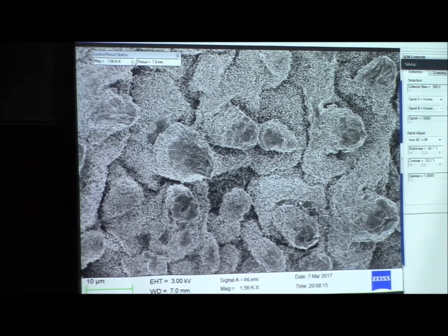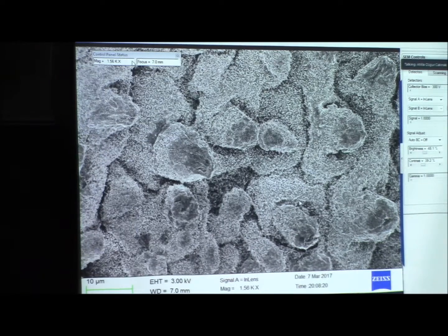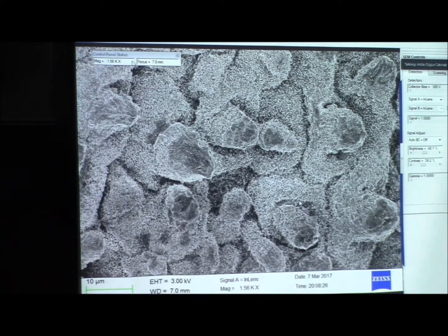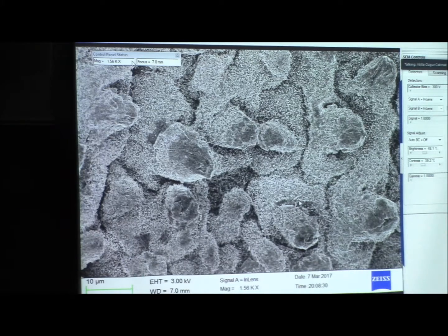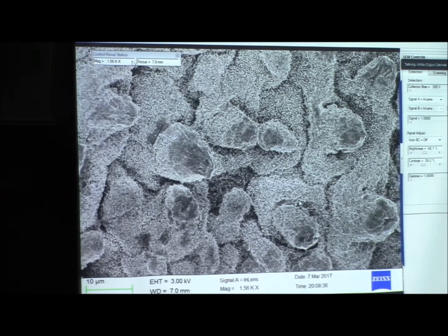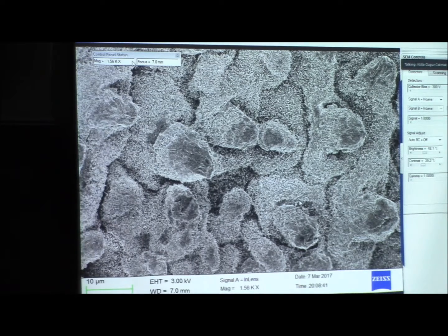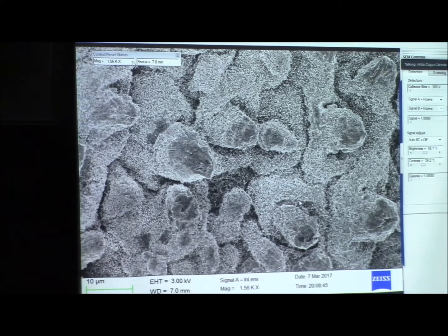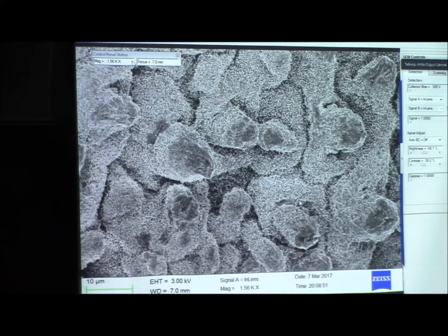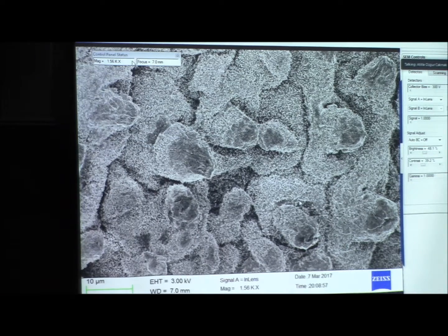The keys to that are not just making them small, but also the synthesis, or let's say nanofabrication aspects. I do not have any sample loaded right now, but we have some transistors and some other materials to show in the remote access. It is not loaded right now, but I can quickly go over it.